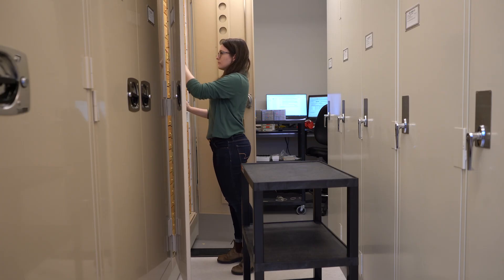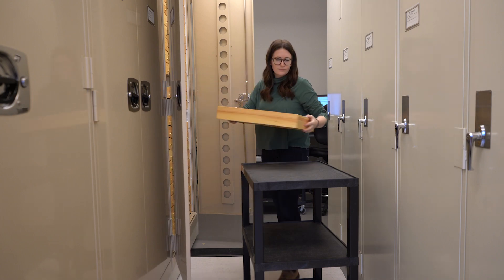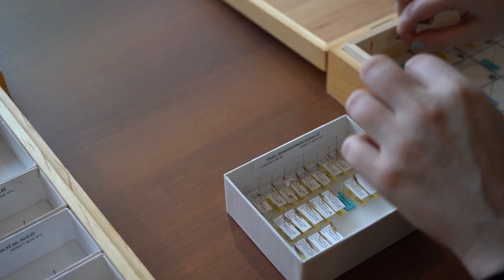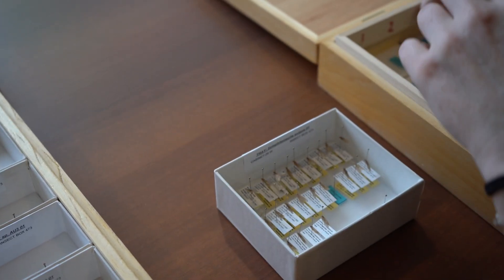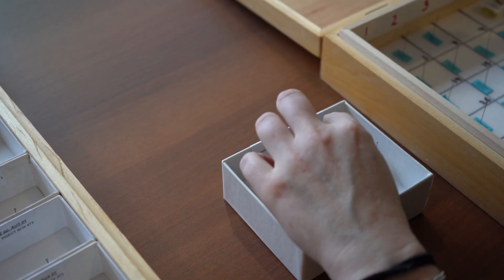Step 7, returning the specimens to the collection. First, refer to your museum harvesting tracking sheet to locate the correct cabinet and drawer location for the first specimen in your array. After finding the placeholder label in the collection, replace the label in the unit tray with the corresponding specimen from your array. Discard the placeholder label. Repeat this process until all specimens from your array have been returned to the collection.